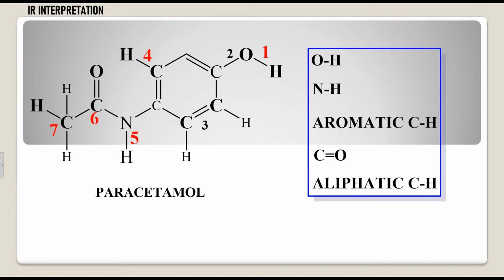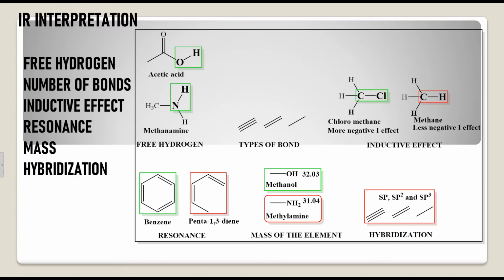This is number two. What you have to keep in your mind: number one, functional groups. Number two, you should be in a position to dismantle the structure based on its functional groups. Next, you need an idea about what factors are present in the structure. If these factors are present in the structure, what will happen? I said there are six factors.